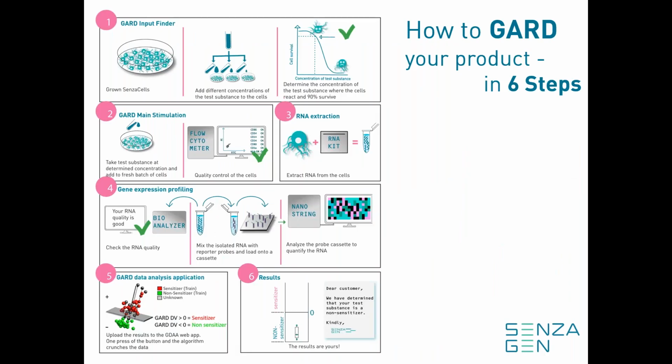So based on this overall strategy, we have also defined a standard operating procedure on how we should test unknown testing substances. And this is, of course, a very broad simplification, but I'd like to use this to illustrate the concept of how we do the testing.